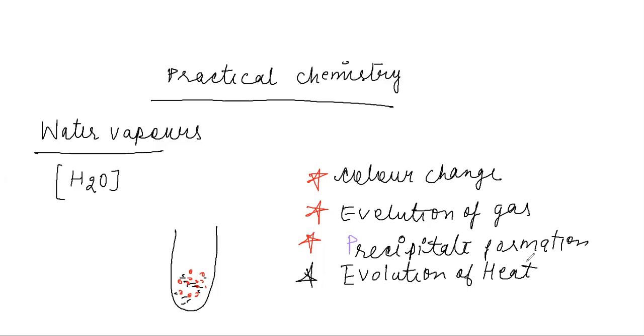By qualitative analysis we identify some gases, compounds, salts, metals, elements. So the first thing we are doing is the identification of gases. In your reaction, gas is forming, and you want to know which gas it is. The first three gases are the neutral gases.